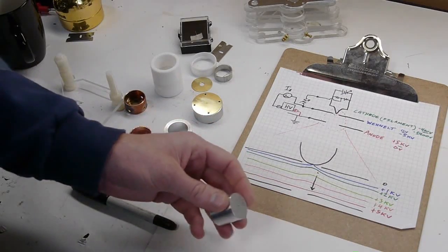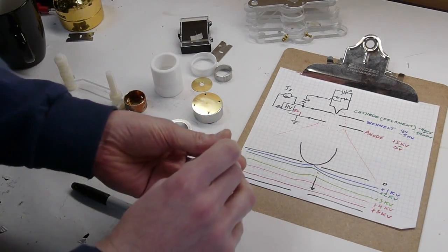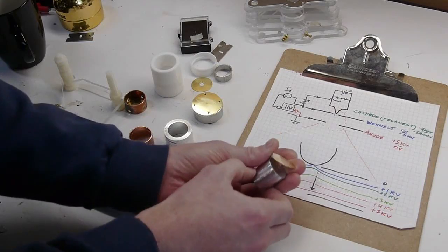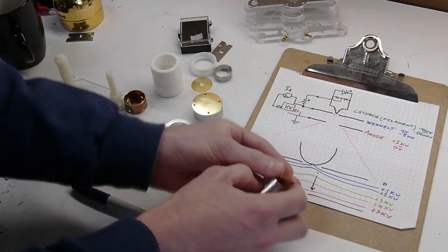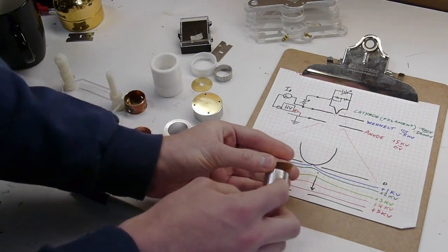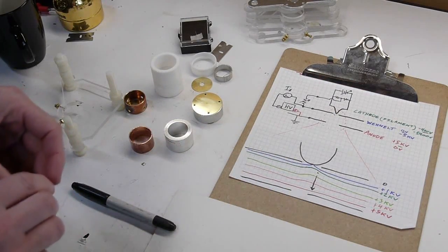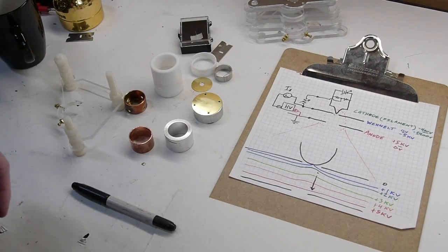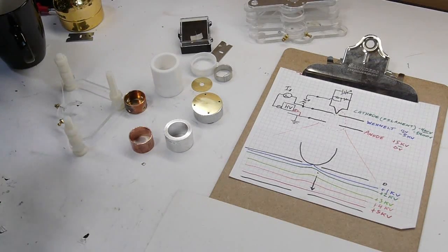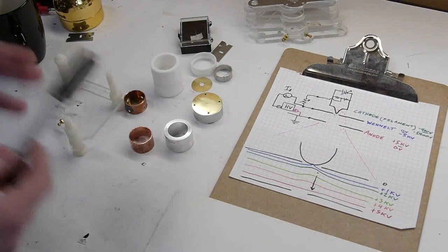So for example, if this is the anode, inside this metal cup there's no electric field because it's all the same potential. But above this cup, if this plate is set up like this and this plate is at negative 5 kV and this is at zero, there's a very high field and that's what actually causes the electrons to move.